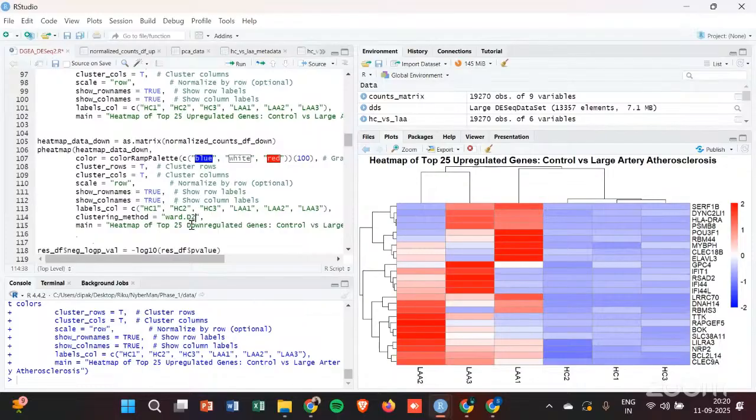Because if you are focusing only on one cluster at a time, you will be making sure that a single outlier is not actually affecting the distance, right? Right now, if HC1 would be very much farther away from HC2 and 3, it would affect the distance measure if you were using complete linkage. But here, if I use this form of linkage, we are actually minimizing within cluster distance to find the appropriate clusters.